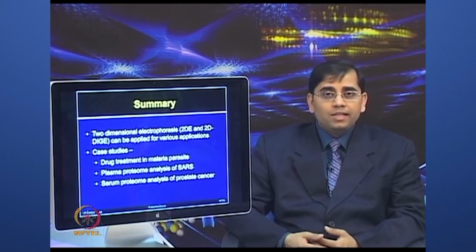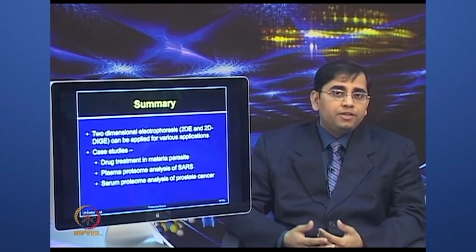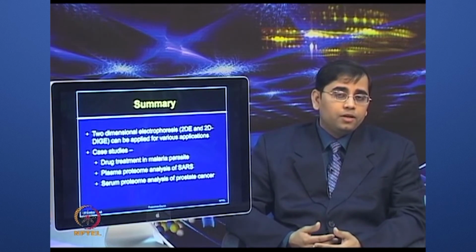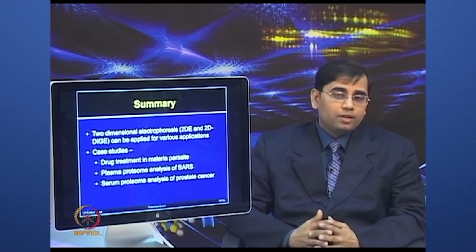But how many proteins you can actually establish as differentially expressed, that fact is the major discriminator between these 2 techniques. You might lose a lot of significant spots by using only conventional proteomic analysis, because you have to apply a large number of gels for those comparisons.